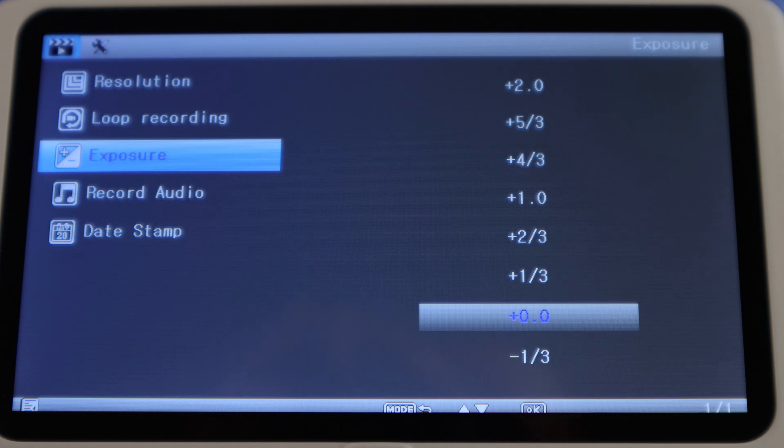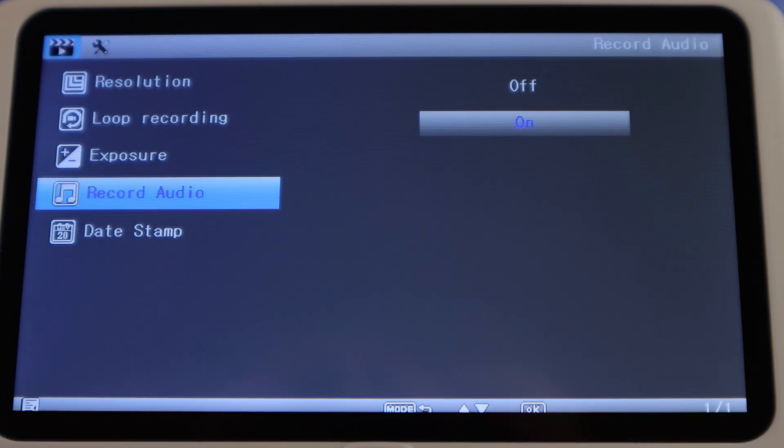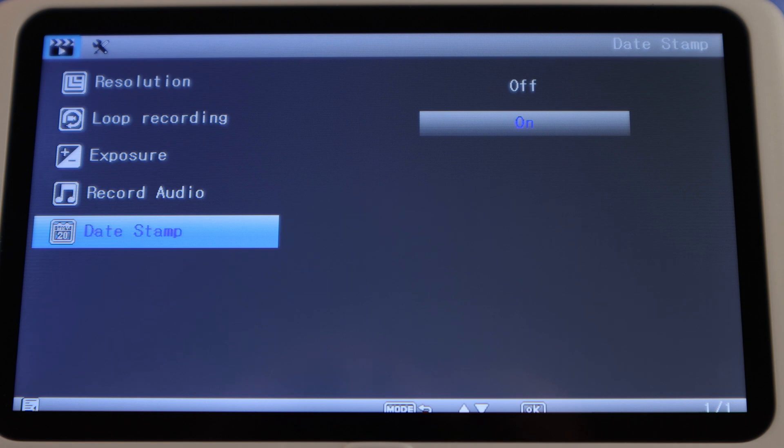Adjust exposure to adjust the brightness of the screen. Turn on and off audio recording, and toggle off and on the date stamp.